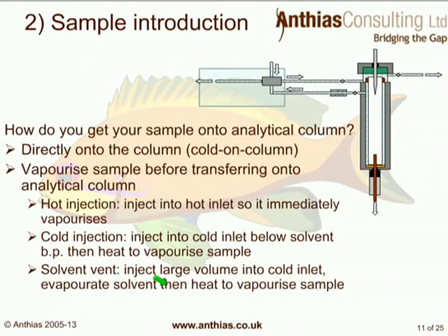So, we've talked about carrier gases, how to have nice clean carrier gases, and also optimize our flow rate through our gas chromatograph and into our mass spectrometer. Let's talk about how to introduce our sample actually into the analytical column to start with.